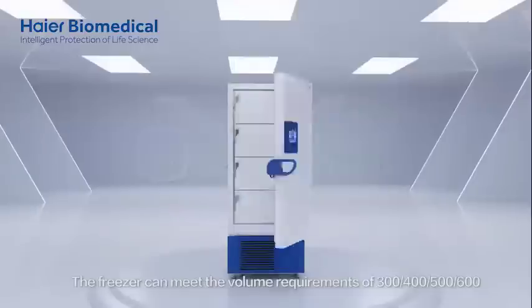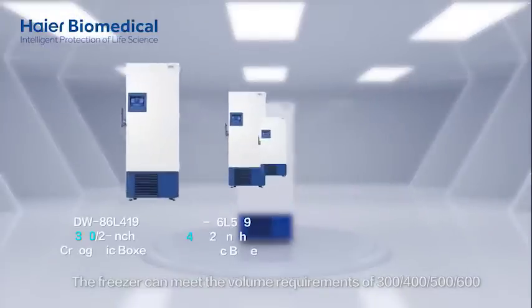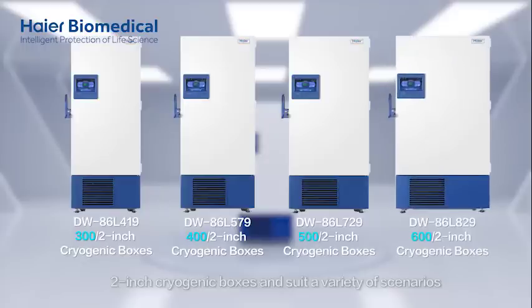The freezer can meet the volume requirements of 300, 400, 500, and 600 2-inch cryogenic boxes, suiting a variety of scenarios.